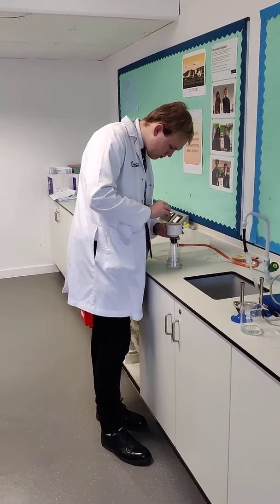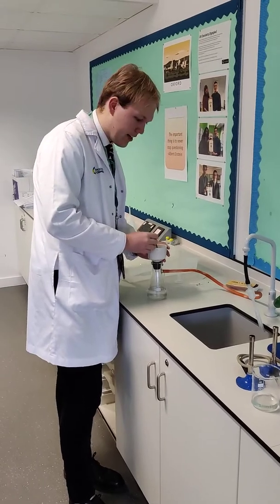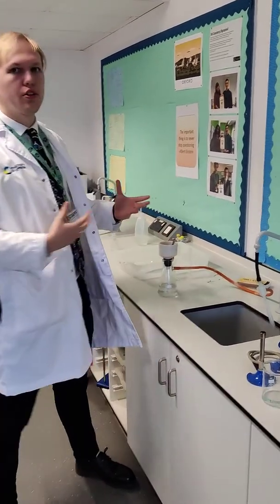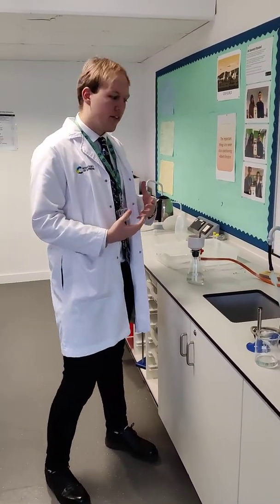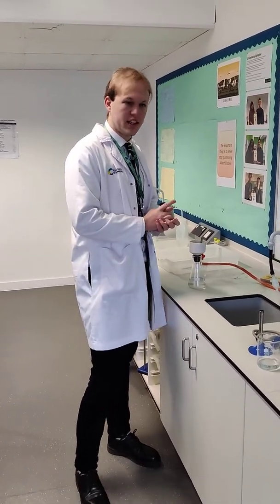We are back with Mr Bell, carrying on with the Cryopractical 10A. So now we've got our crude product of aspirin, but this contains a lot of impurities just from the process of our experiment today.